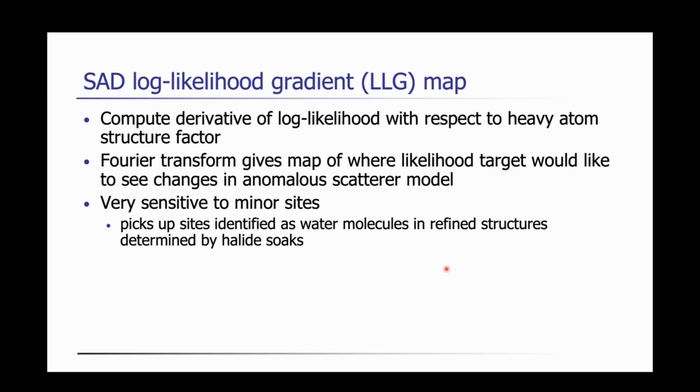This is still used occasionally for solving structures, but it's more important now as a way of identifying what anomalous scatterers you have in your crystal. So if you have even chloride ions or sulfurs, but also calciums, or in the tutorial, we'll look at iron atoms.